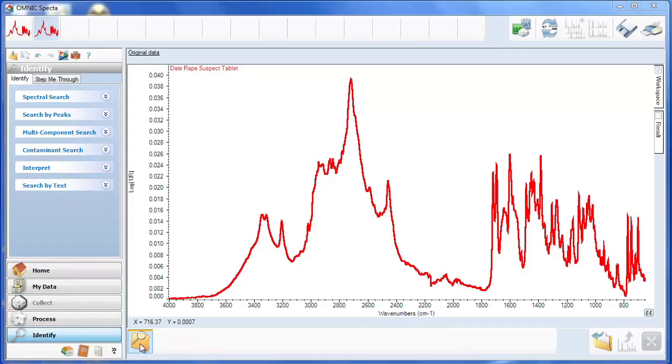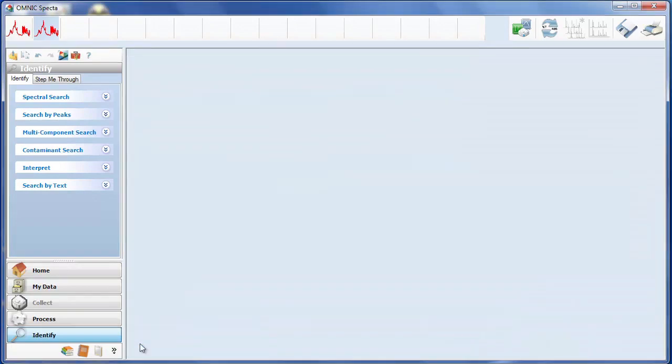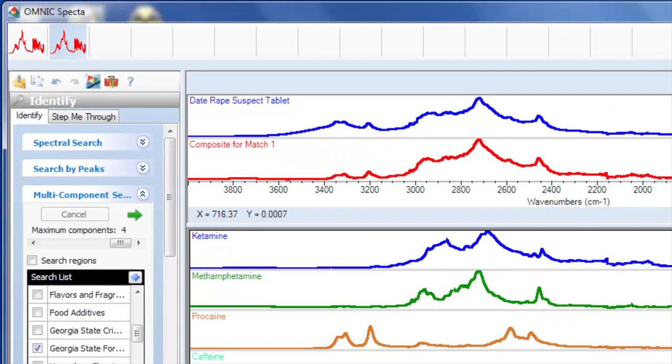Once your spectrum is collected, the exclusive OMNIC forensics package lets you identify up to four compounds in your sample, quickly and easily, without data manipulation.